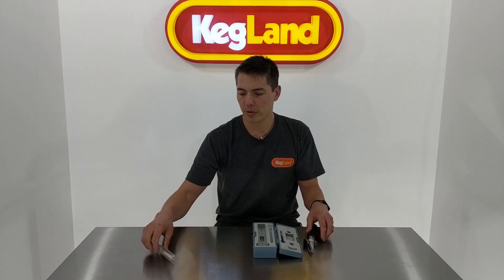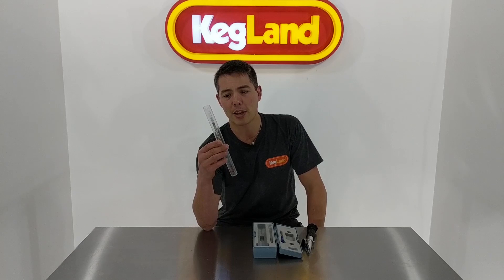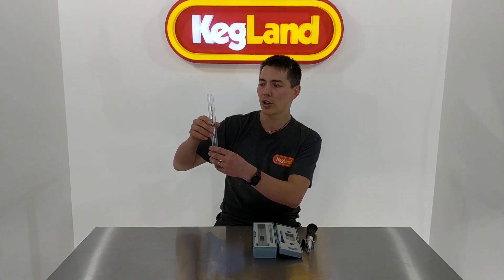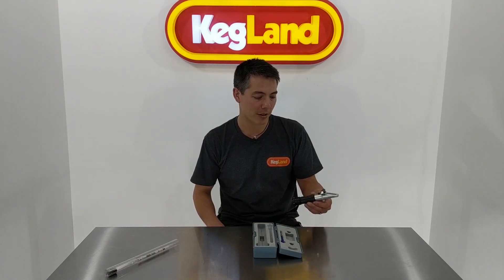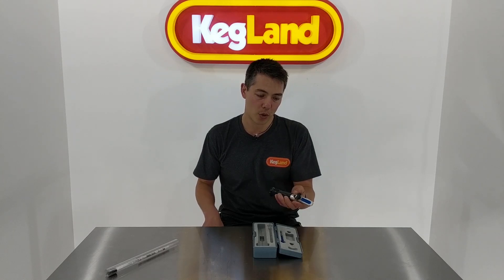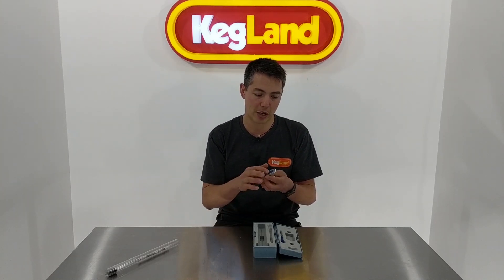With a traditional hydrometer, you'd have to cool each sample down and collect a large amount of wort each time — a lot of stuffing around. However, if you're fly sparging from your mash tun, with a little refractometer all you need is a very small sample, and literally within a few seconds you can get an accurate reading.